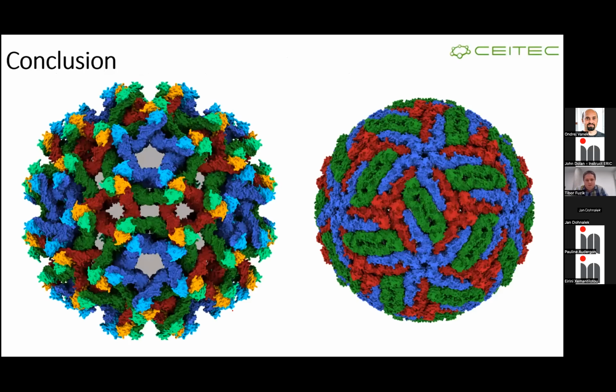Conclusion: we can see that if we go for a perfect immature particle that we assemble from our molecular model, it's nicely spiky and its organization greatly differs from the mature particle. And during the maturation process, all these proteins, where the PRM is dissociating, have to undergo a shift and rotation to achieve the final positions on the particle.